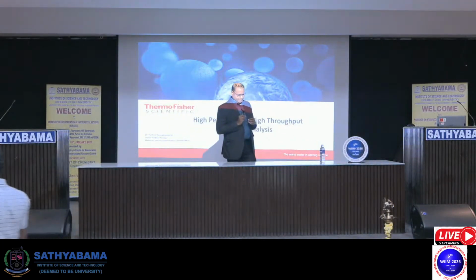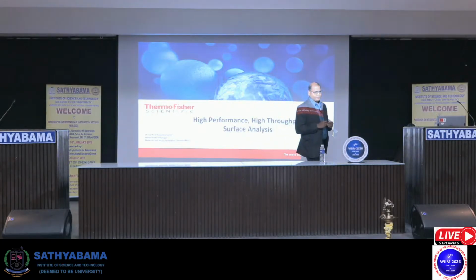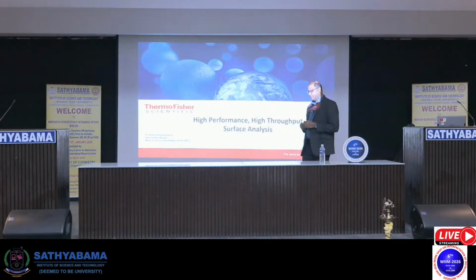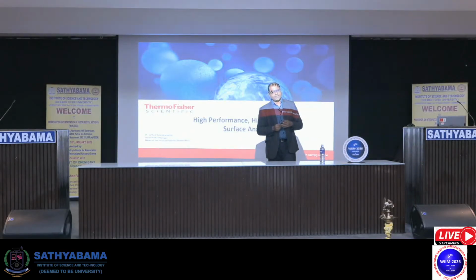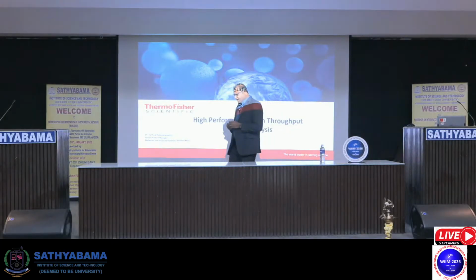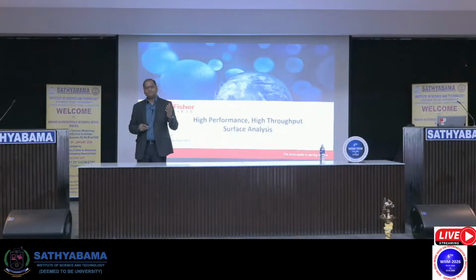So ladies and gentlemen, over the next 40 to 45 minutes, we are going to discuss a technique called XPS, X-ray Photoelectron Spectroscopy. If you look into the literature, XPS is also referred to as ESCA, Electron Spectroscopy for Chemical Analysis. This technique has been in existence for more than 40 to 45 years.